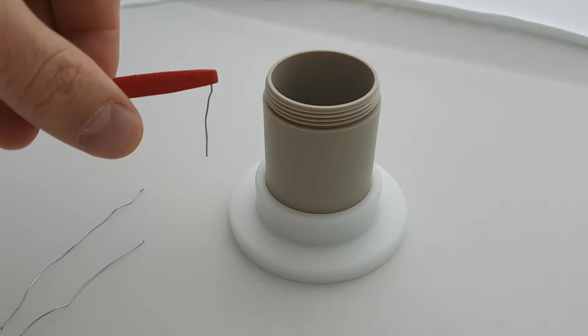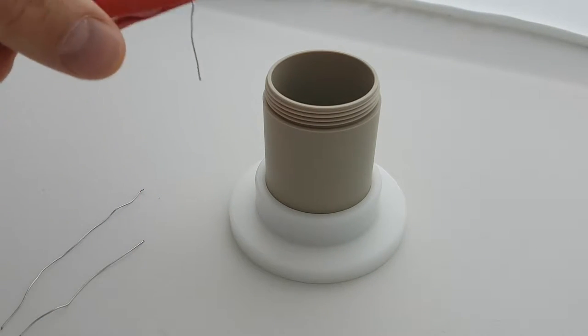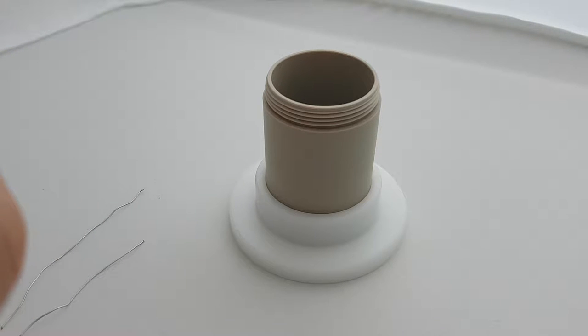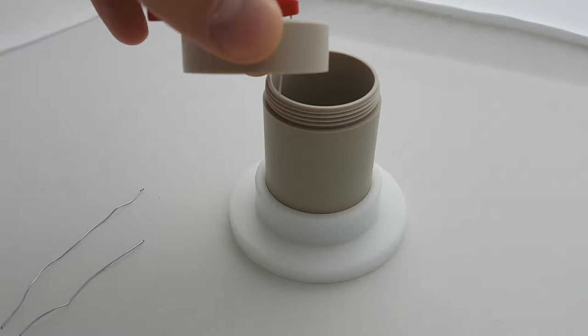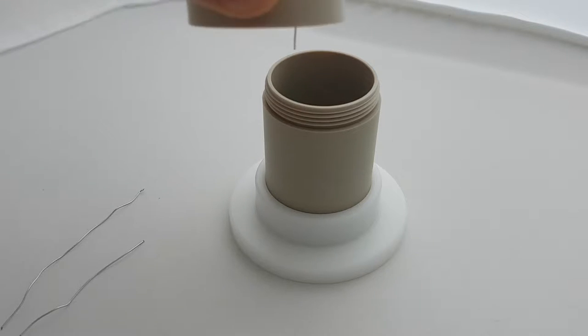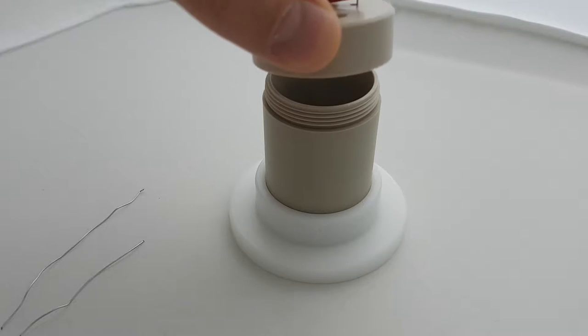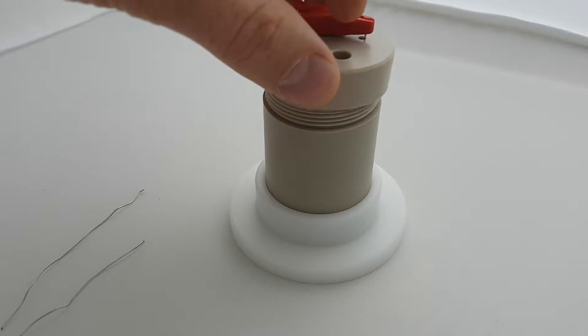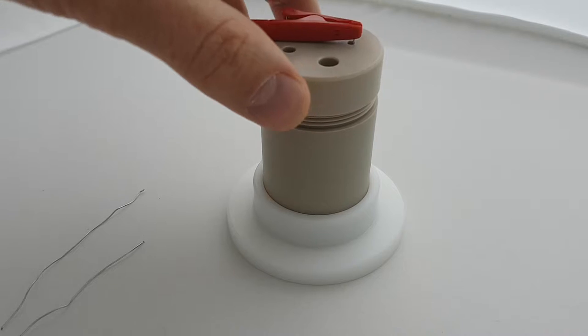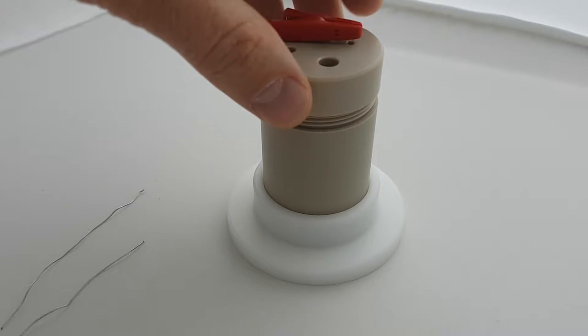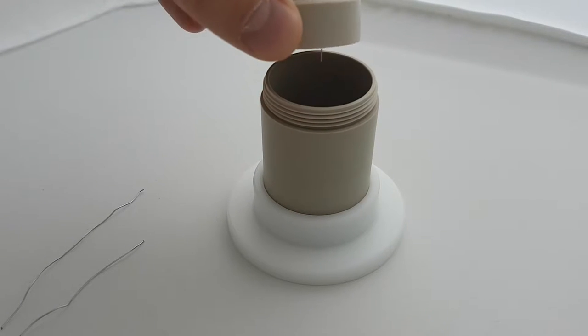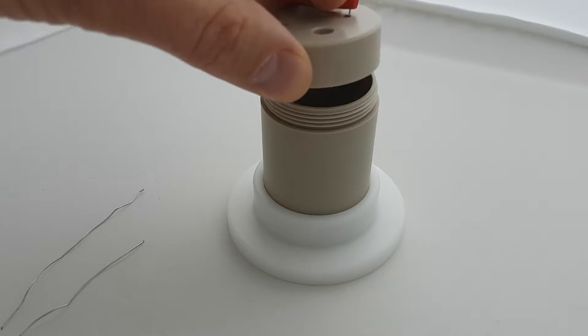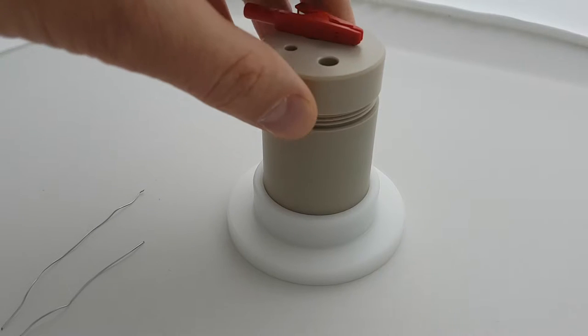Here I have a 25mm wire electrode. You can effectively poke that through the top and then that will dip down into the liquid. I feel that 25mm is a little too short to realistically use with this cell.